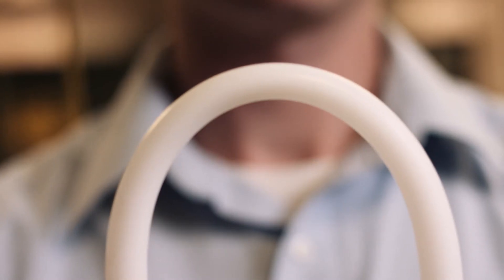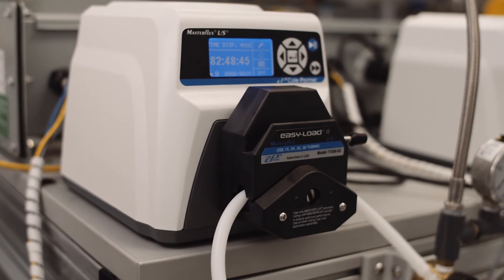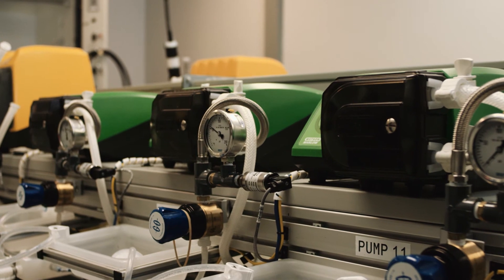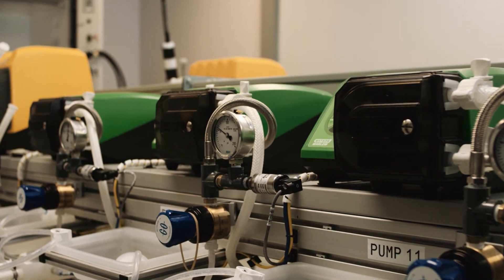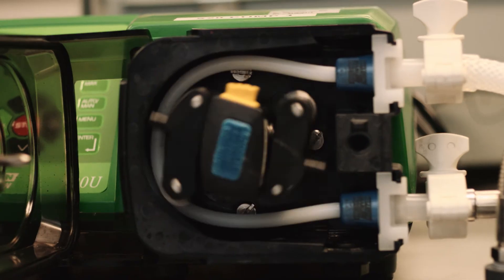Does your pump tubing look this good after 1800 hours? Reduce your risk of losing valuable drug product with Gore's Stay Pure Pump Tubing.